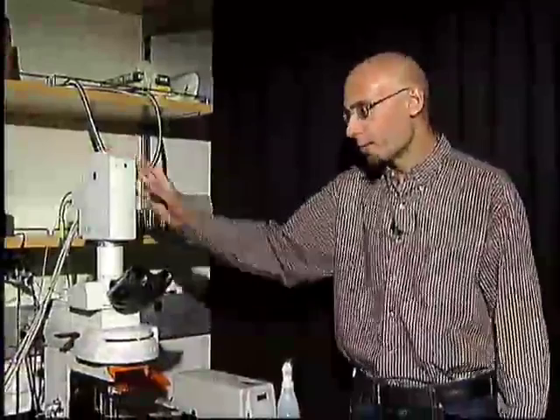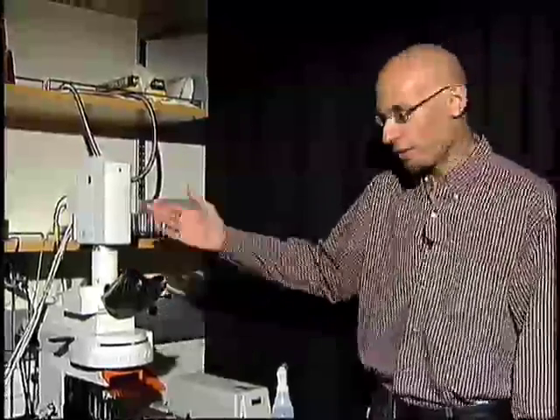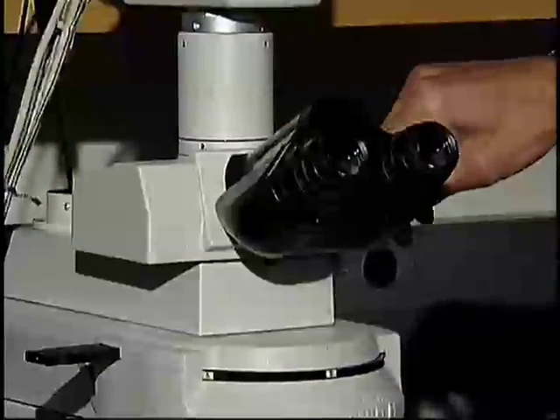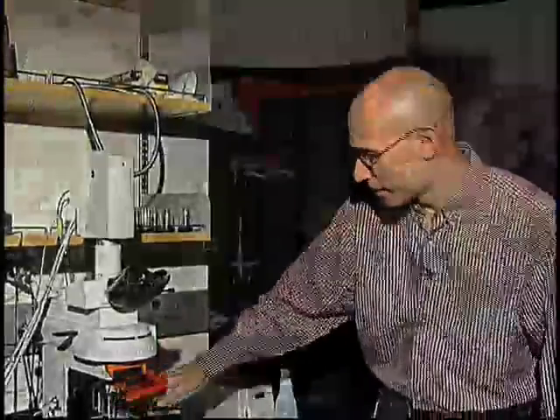This unit is bolted on top of an upright microscope here. This is an FN1 upright scope. The scope itself is very simple. It's a totally manual scope. We've got eyepieces here. You can switch between the confocal and the eyepieces with this lever. And then the objective sits here and your sample would sit on the stage here.